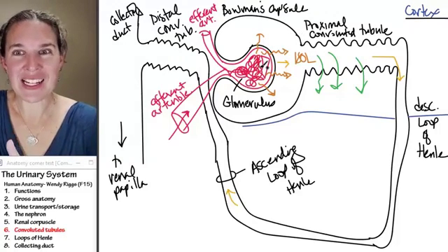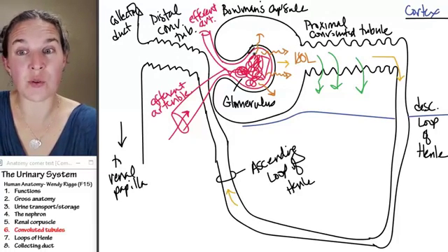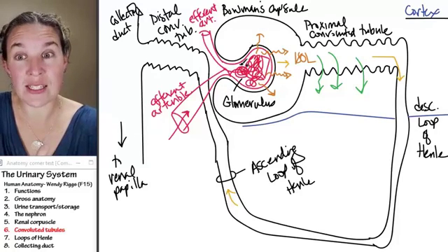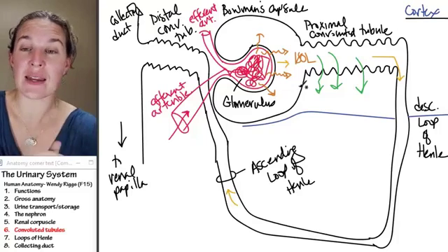We're going to expect to see distal convoluted tubule and proximal convoluted tubules in the same level of cortex that we see glomeruli. So let's go look at that.